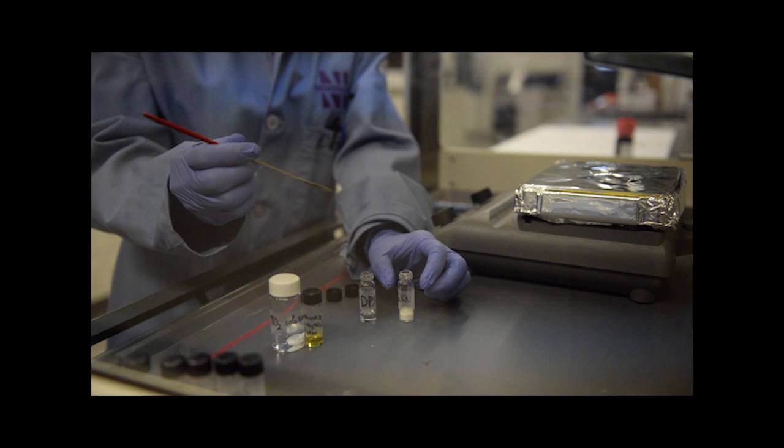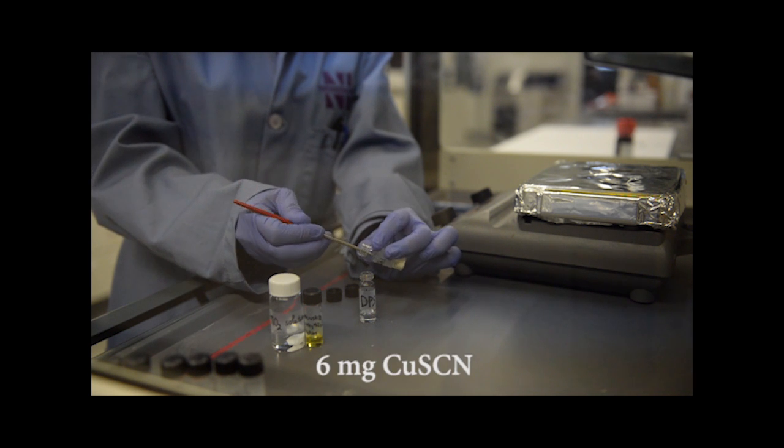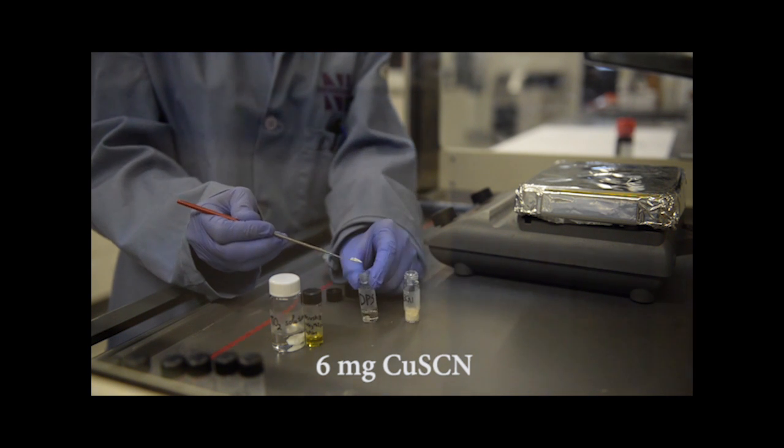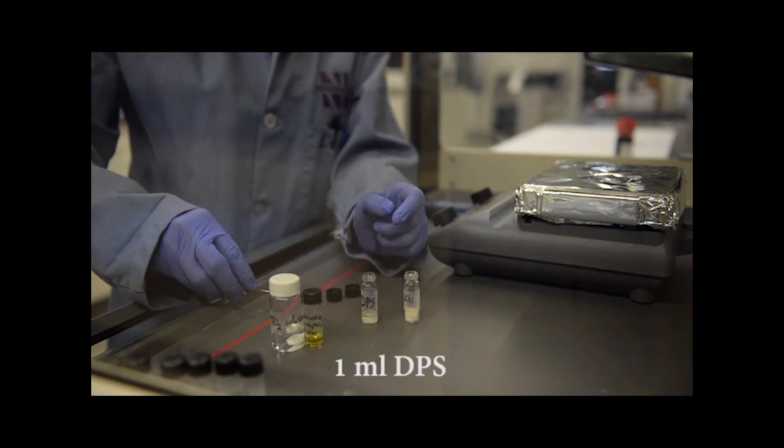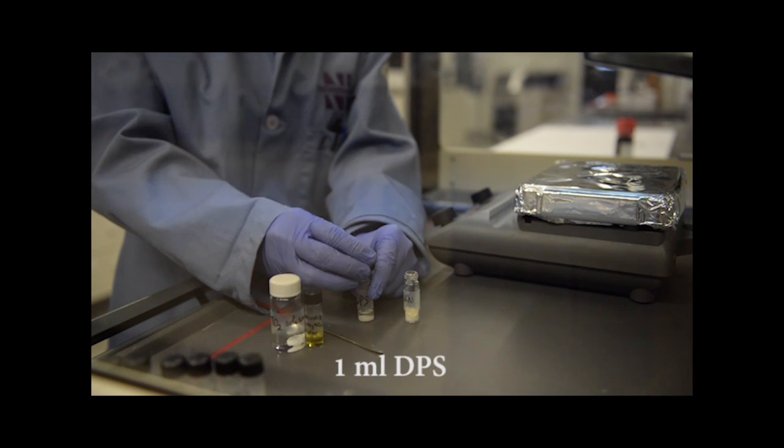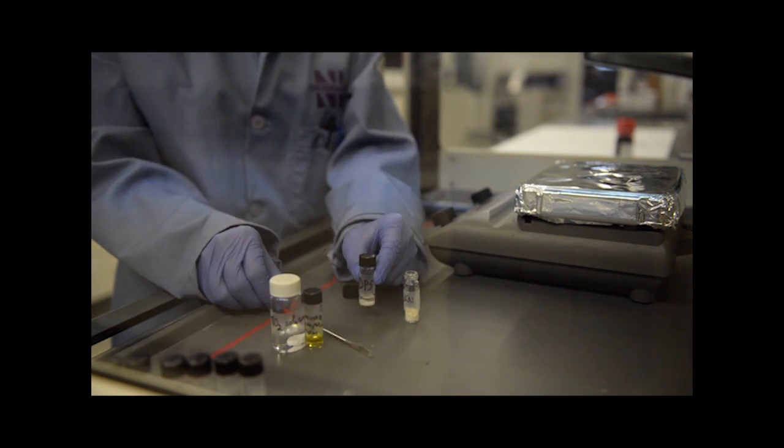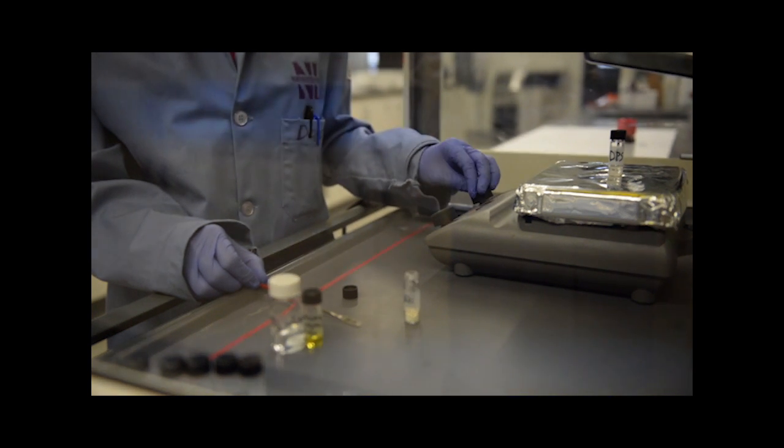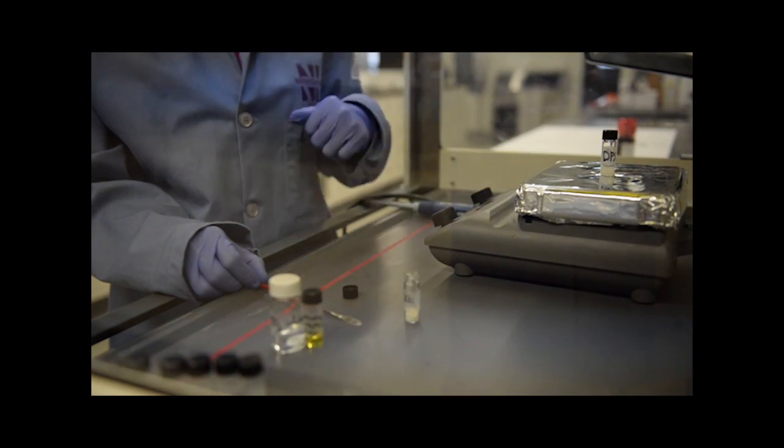Lastly, we will make a 0.05 molar copper thiocyanate solution by stirring 6 milligrams of copper thiocyanate powder in 1 milliliter of dipropyl sulfide solvent at room temperature overnight. The final solution should look colorless and transparent.